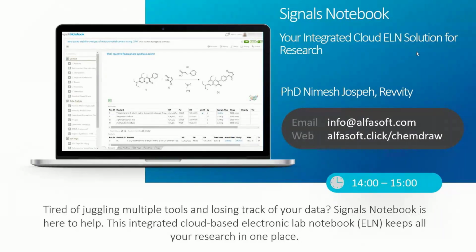Alternatively, Signals Synergy offers a unique solution for contractor data exchange. Rather than requiring the CRO to manually copy and paste their data into a requested structured data format, the data exchange performs this transformation for you.